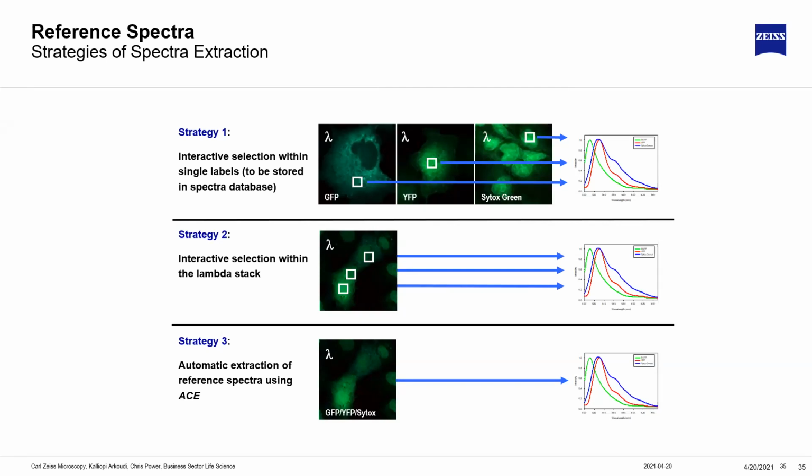The second strategy is also good, like selecting by yourself what spectrum labels which structure, but it requires spectra that are nicely separated so that you can select by yourself accurately. And of course, it's more prone to user error. The last strategy is, I guess, the least optimal one. However, it is the easiest because you don't need any preparation, and software is getting better and better in automatic recognition. So you could try which one fits your experiment depending on your specific needs.